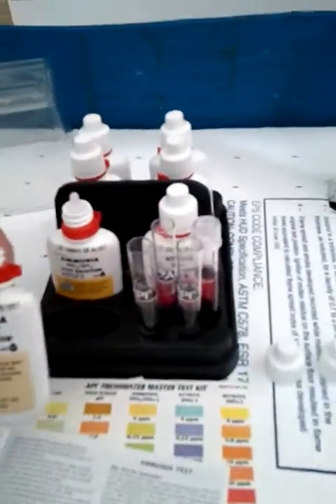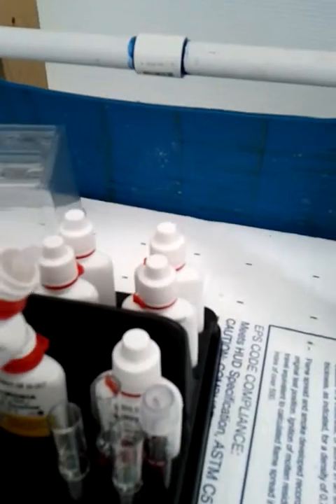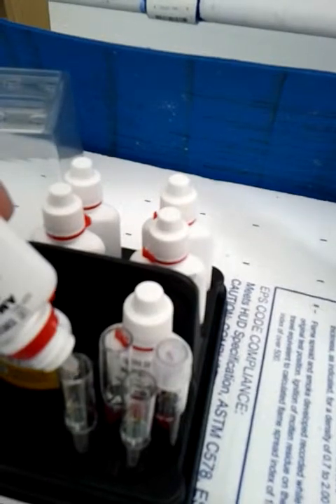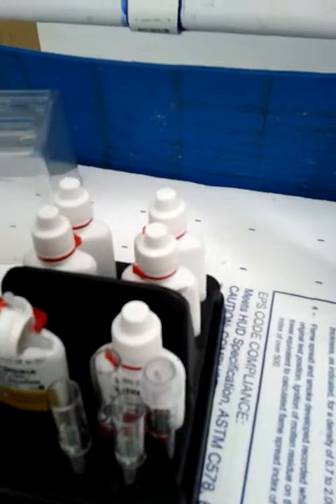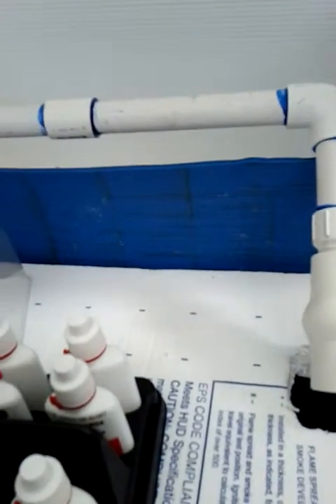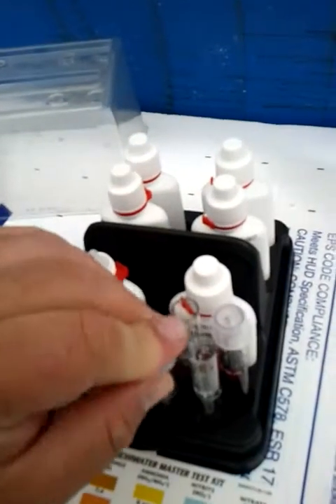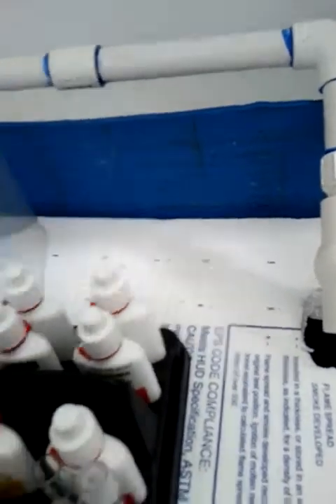Now I'm going to do the ammonia test. It says that we need to add 8 drops from this one. Throw the lid back on this guy — it says it should be shaken up, basically. Make sure it's mixed good. And then I've got to add 8 drops of the other one. Hold on a sec here.